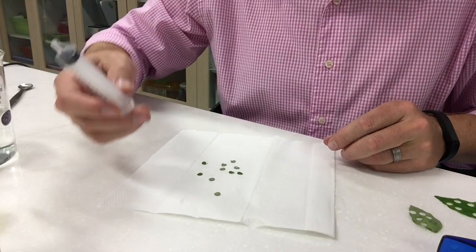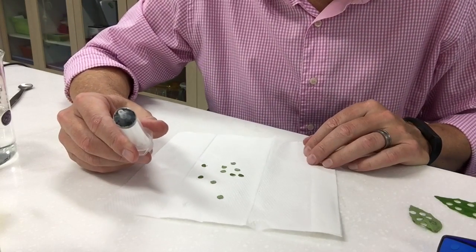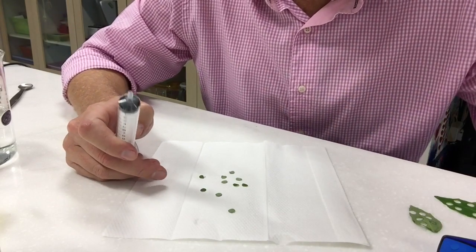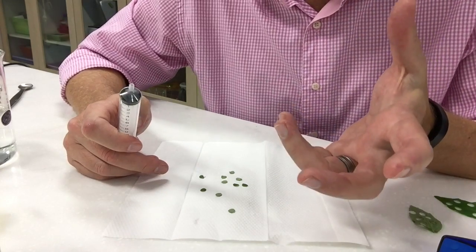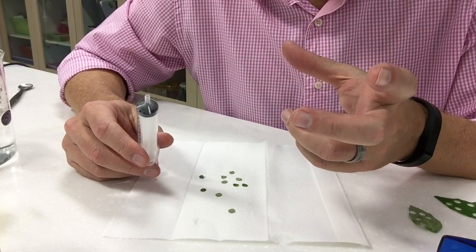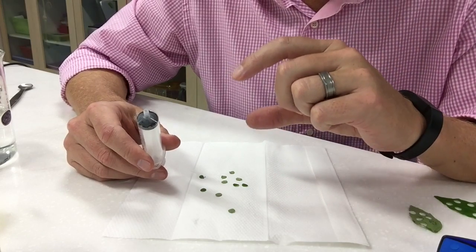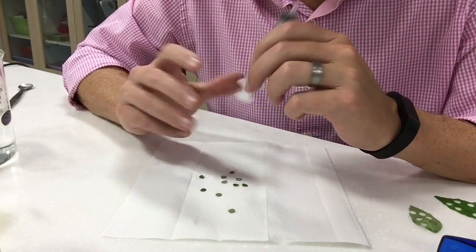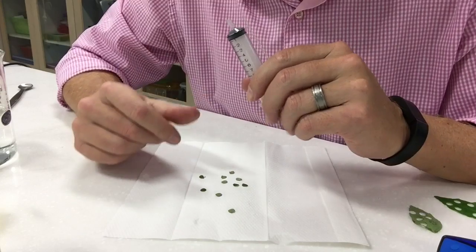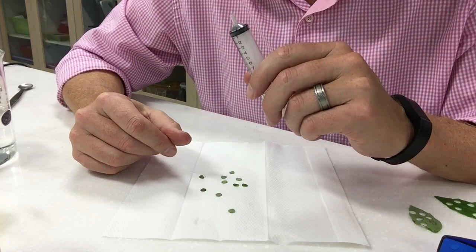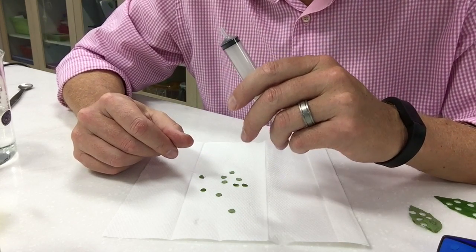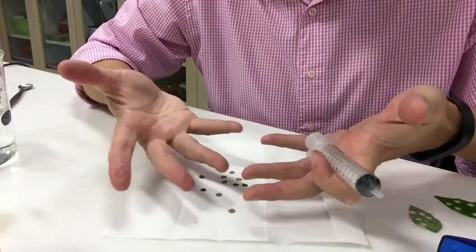Now the tricky part is going to be evacuating the air out of the leaf because what we're going to try and do is we're going to try and take all the air out of the leaf tissue so that the leaf actually sinks in solution. And then what we're going to do is shine a light on them and hopefully those leaf discs will rise because of the production of oxygen that gets trapped in the leaf and then they come on up.